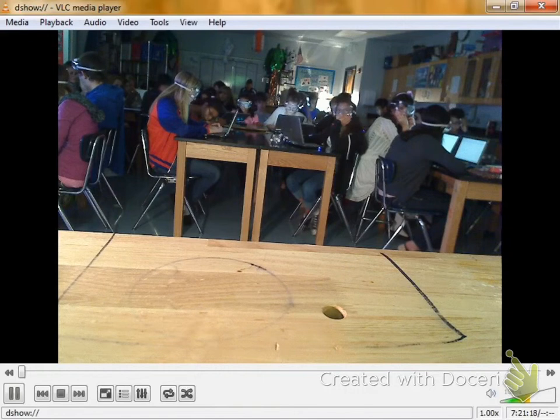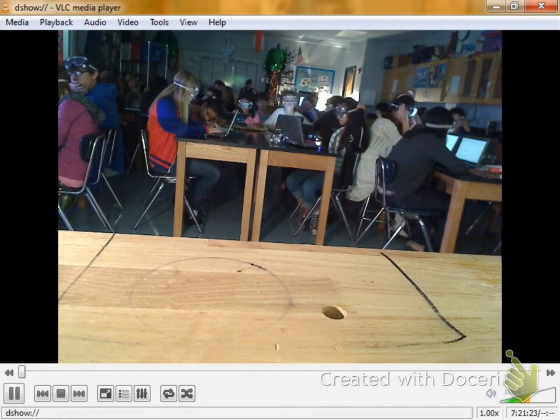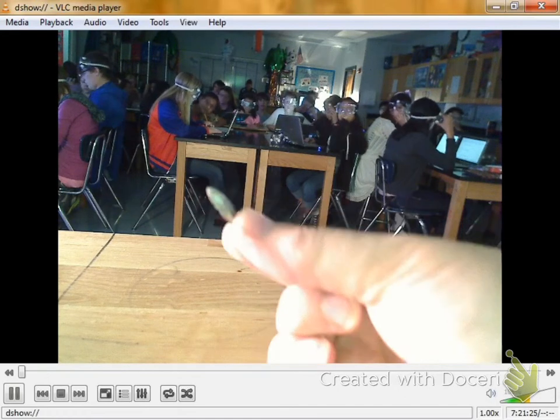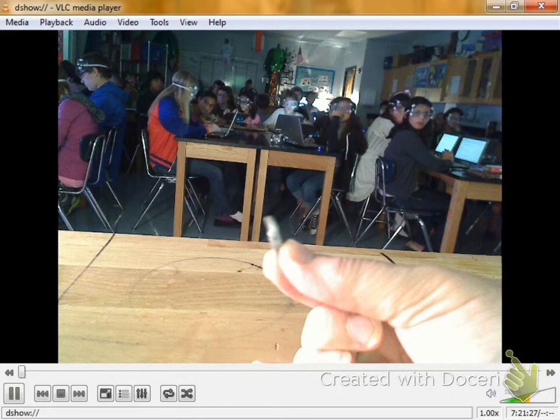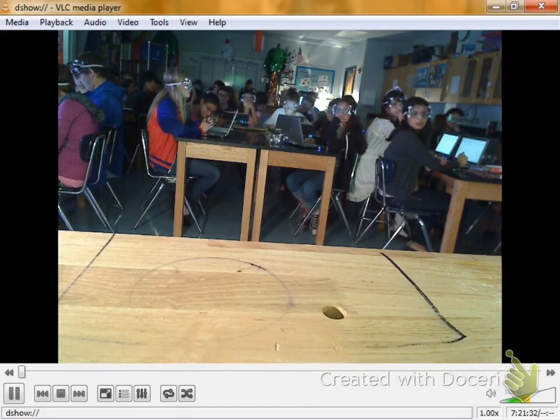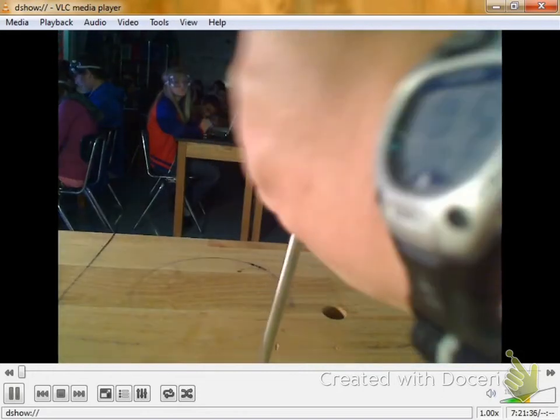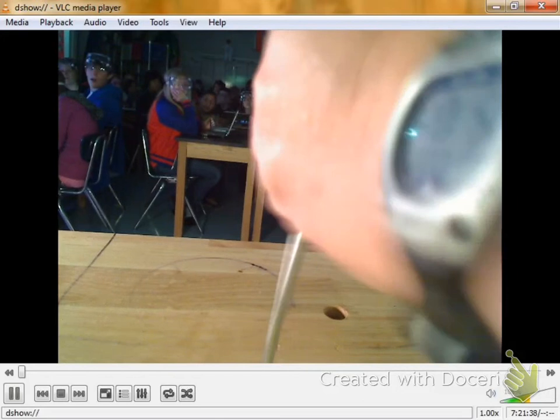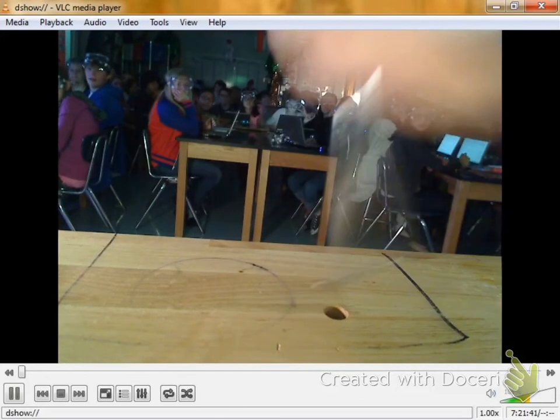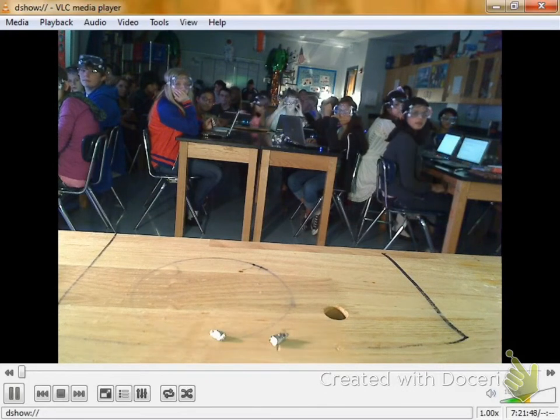So I've got a chunk of calcium here. It's just a piece of gray metal. I guess it's really not all that exciting. But if I sit here, I can cut it in half with my hammer and my screwdriver.